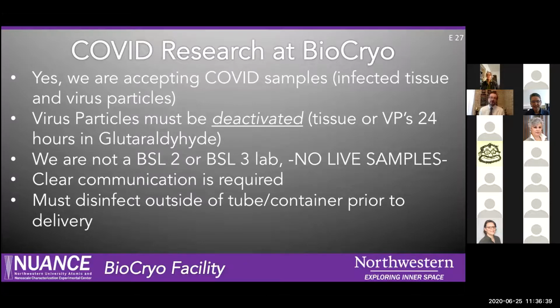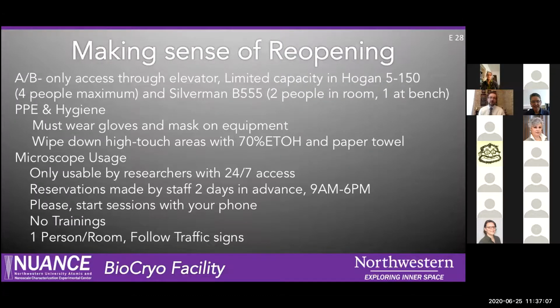Everything that we receive must be fixed for at least 24 hours in glutaraldehyde to deactivate the virus. Please disinfect the outside of the tube as well. But I just want to say that we really do want to help. We would really love to look this thing in the eye and assist in research any way we can during this pandemic. So we've established some protocols to try to keep everybody as safe as we can.